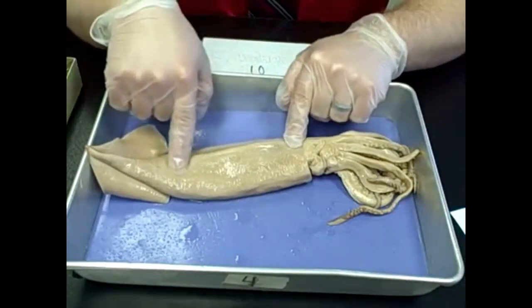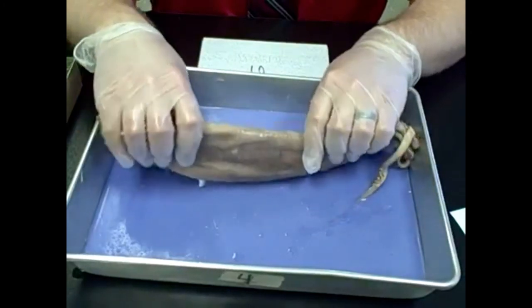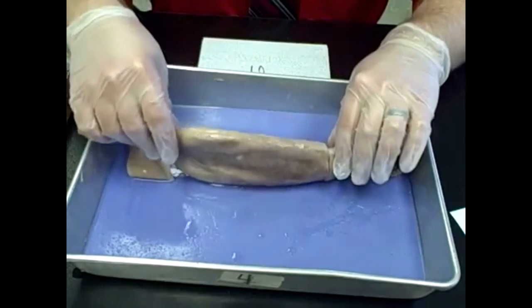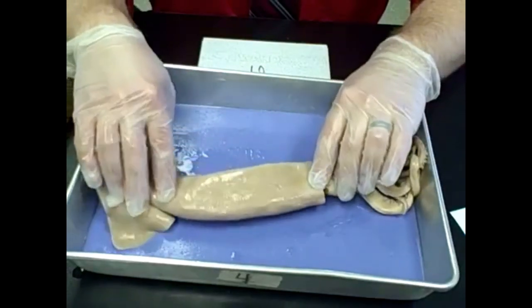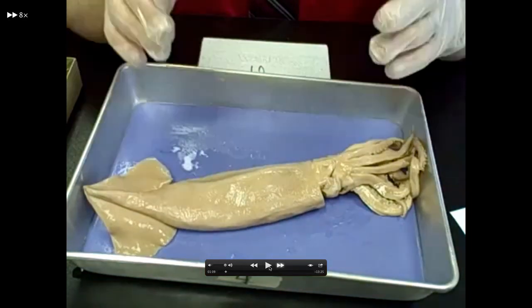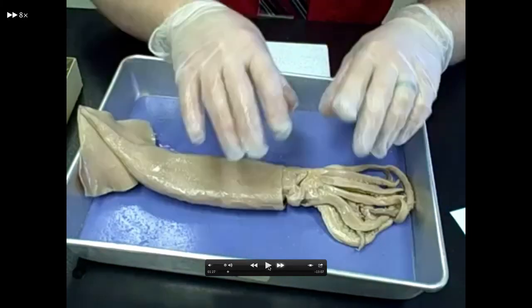So this outer layer of skin is called what? The mantle. The mantle, very good. He has the back that he's showing, and that has the pen in the back. And I'm going to fast forward just a little bit. So he gets ready to cut it open.